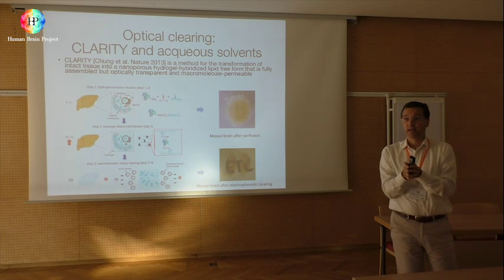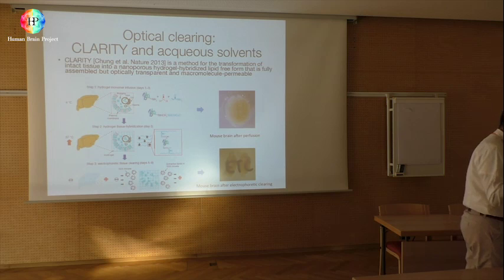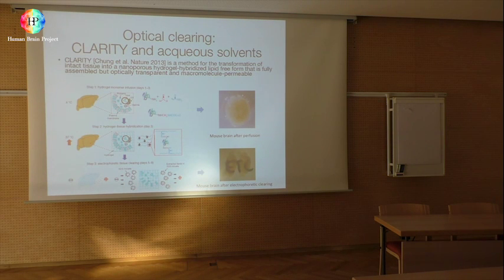Unfortunately, the final step of Clarity is the clearing protocol, because Clarity first removes the lipids and then clears the brain.